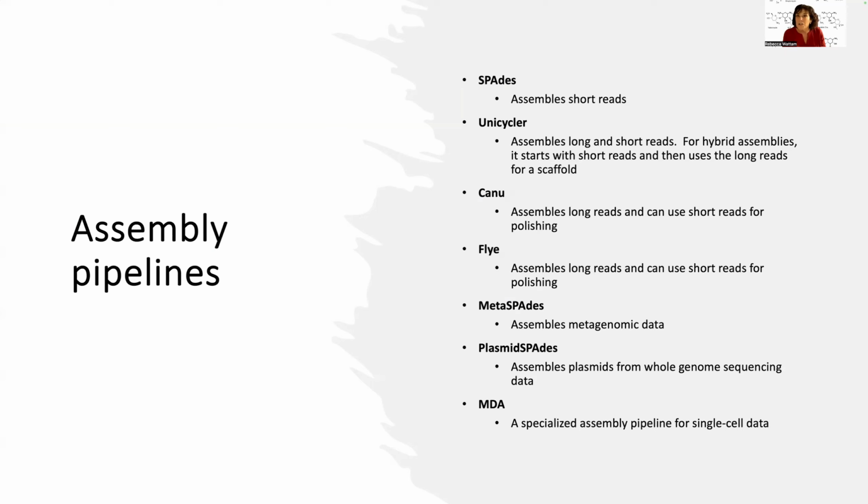So I would encourage you to do that. It gives you many fewer contigs. But anyhow, if you choose Unicycler for a hybrid assembly, what it first does is start with the short reads and start generating a scaffold, but then it brings in the long reads, and it's bringing the short read scaffolds to the long reads to try to get a nice assembly.